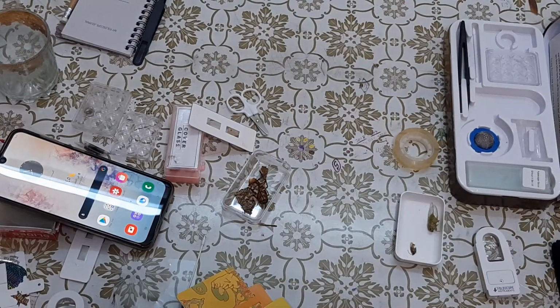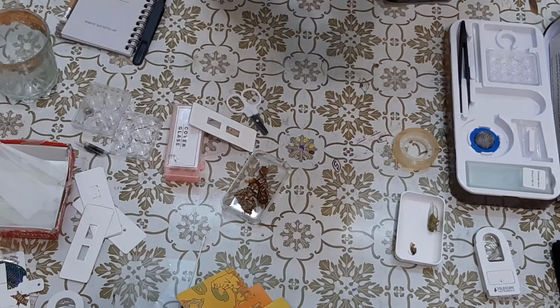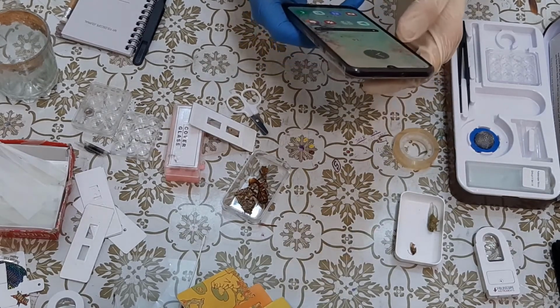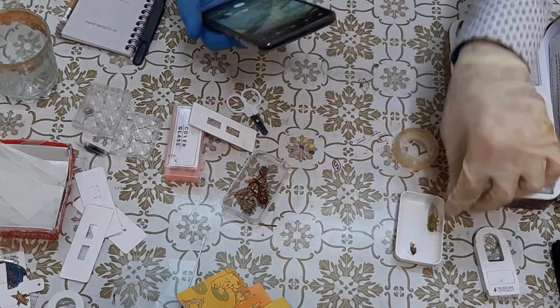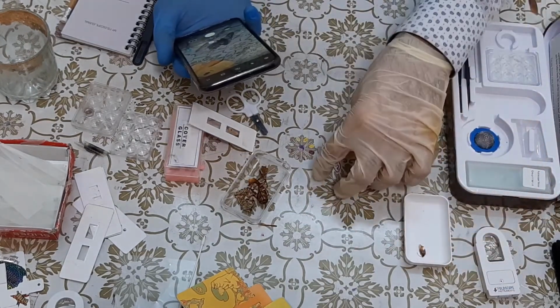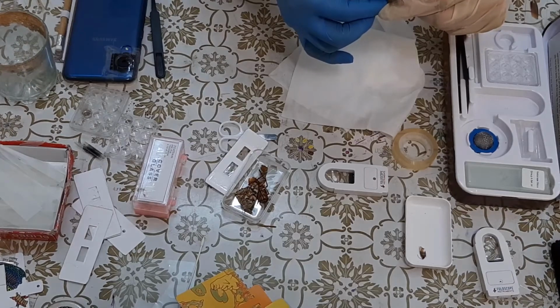To the last part, which is the new insect that I found. First of all, I'm going to take a couple of pictures of it directly with the phone, because I'm afraid I might damage it while I use it. So actually I don't know if they are flying insects or not.